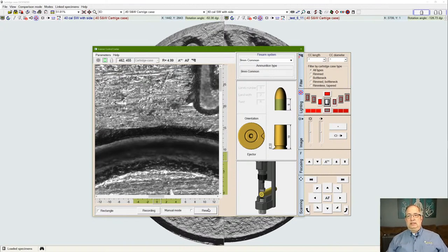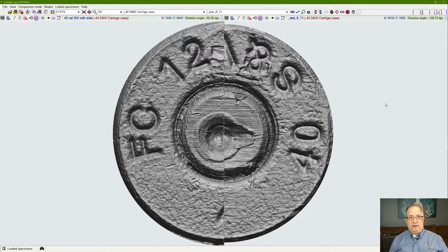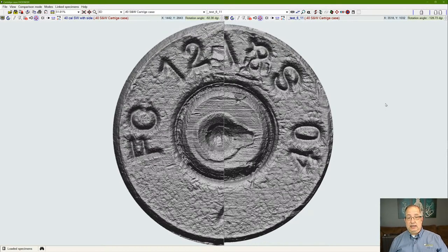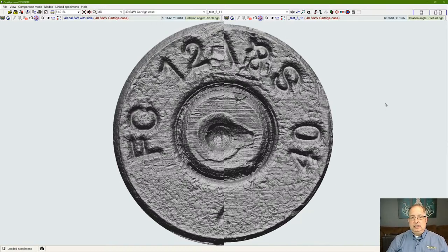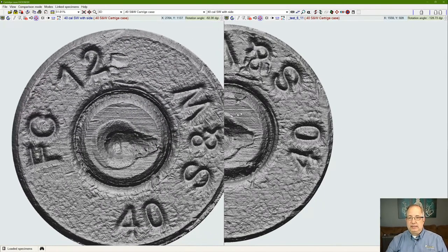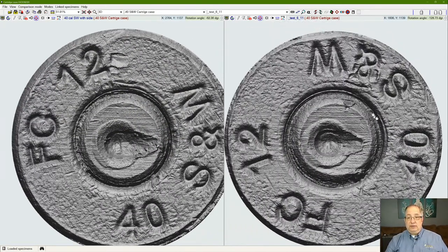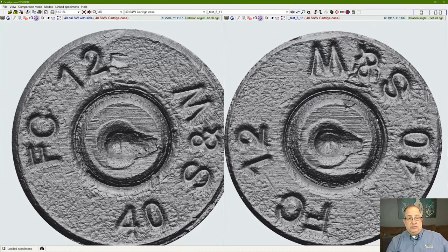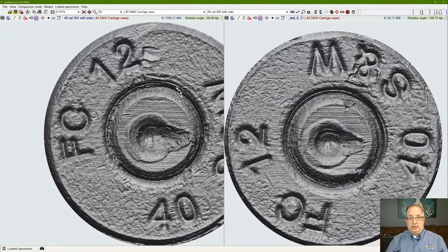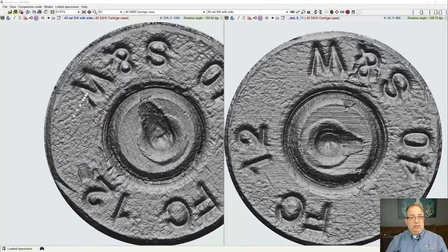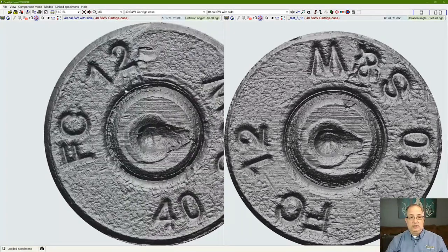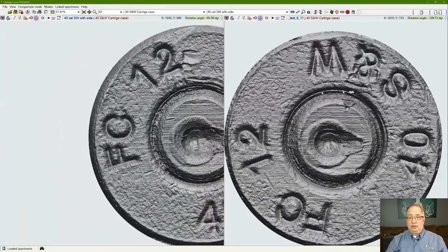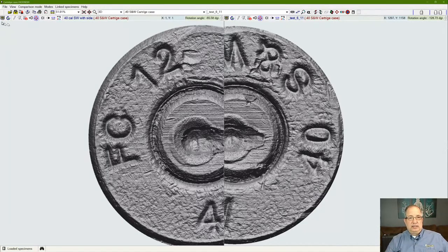Once the system has generated the image, we're going to get these images shown in the software interface, either as a cartridge case view, which we're looking at right now with two samples, or as a bullet view. The nice thing about this interface is that it gives us a full 3D representation of the samples we're imaging. We have two of them right now showing as a virtual comparison microscope. We can individually control these in the XYZ, rotate the samples, align them to each other, and control our lighting for them.